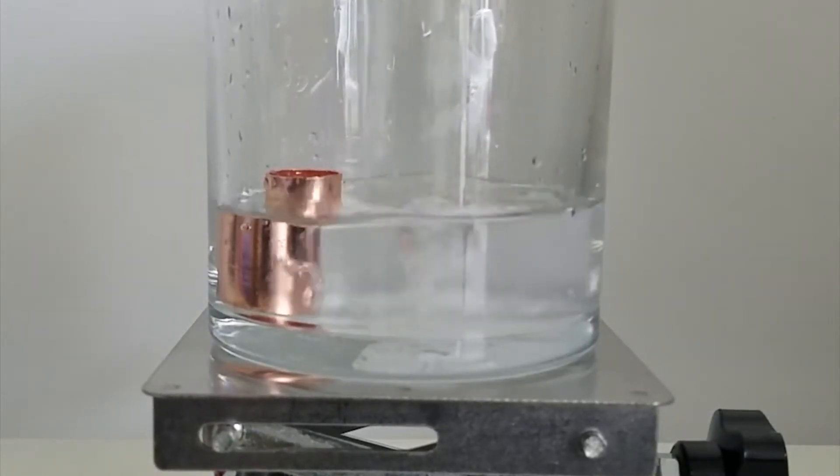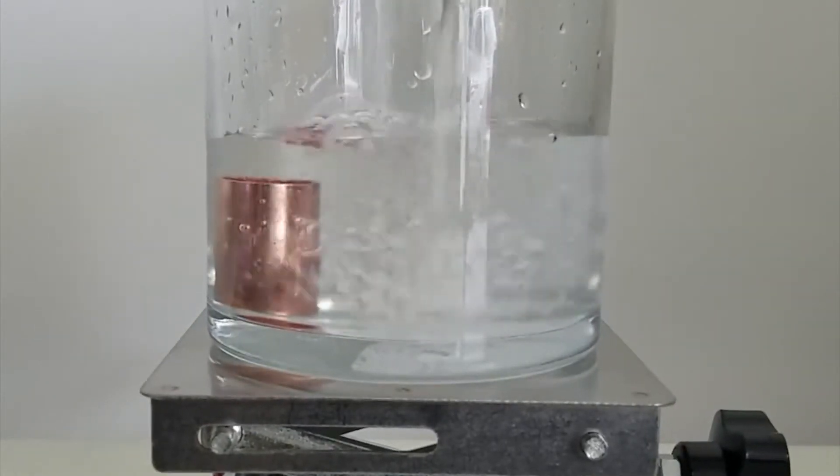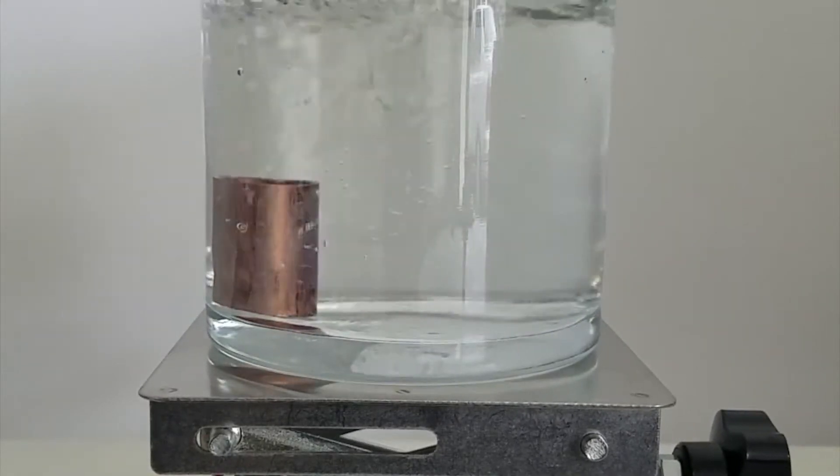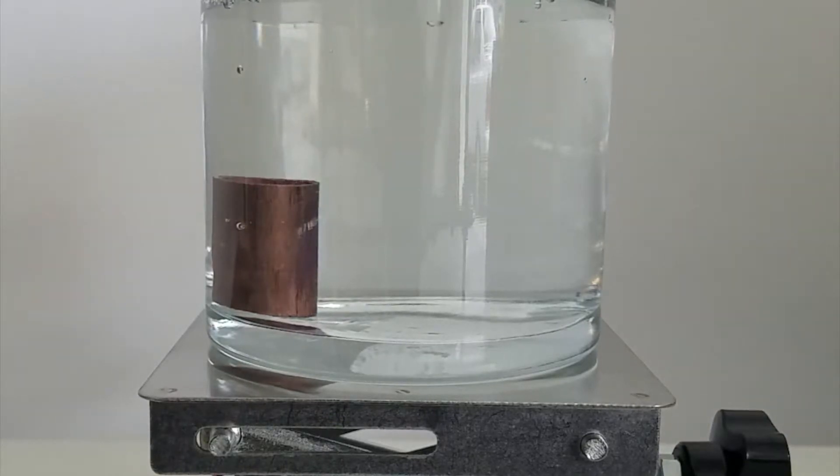As you can see, nothing really happens when I added the hydrogen peroxide until I added my acid solution. At this point, the copper pipe rapidly turns darker in color. This is because the acid breaks down the coating on the copper pipe, which allows the hydrogen peroxide to oxidize it into copper oxide.